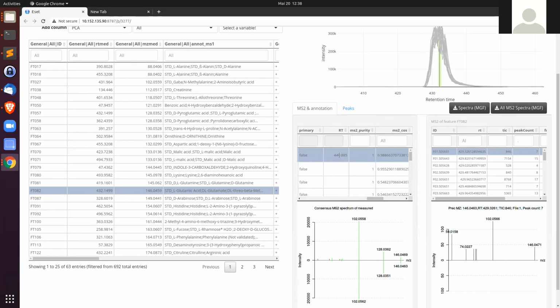It's only 8 seconds of difference. I think if the difference is less than 30 seconds, it's a very good match. Maybe less than 50 seconds is also acceptable. But that's another piece of information we can use for developing confidence about the annotation.